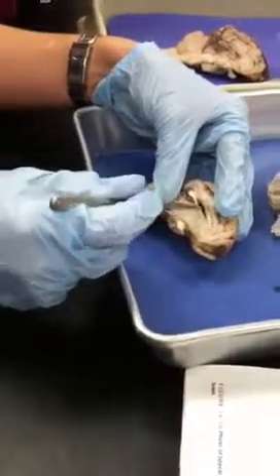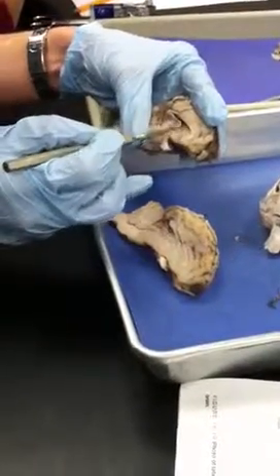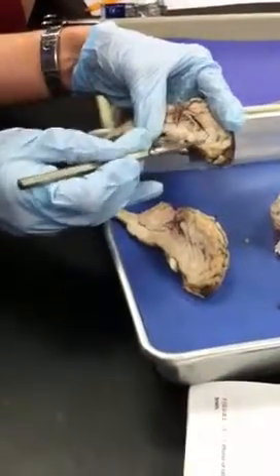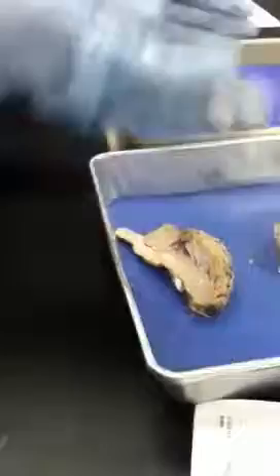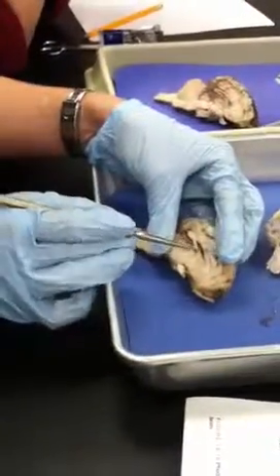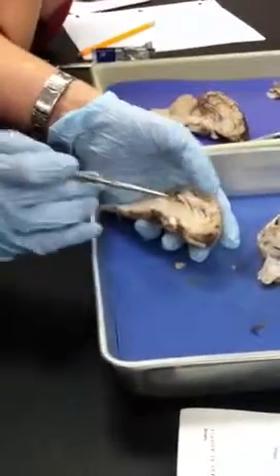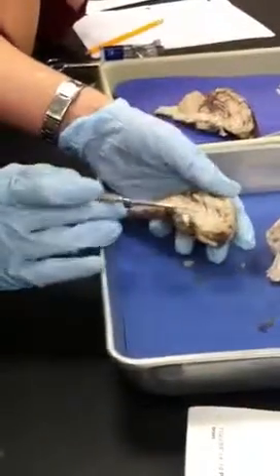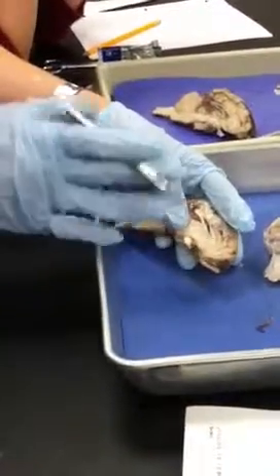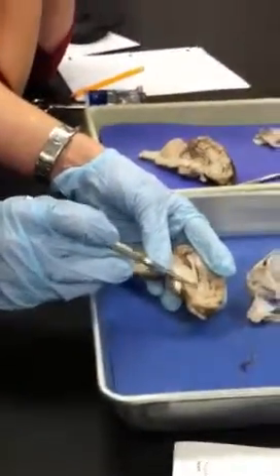And there's a piece of tissue that I just poked through, on both sides, but it runs over the top. That's the septum pellucidum. It's sort of the membrane in the middle of the two ventricles. Okay, so the corpus callosum is the stuff around it, right? Just the top part. The stuff on the bottom, we're getting into limbic structures like the fornix. I'm not going to ask you to tag the fornix or anything like that in a sheep because it's really hard to determine what's what. But the top part is definitely the corpus callosum.